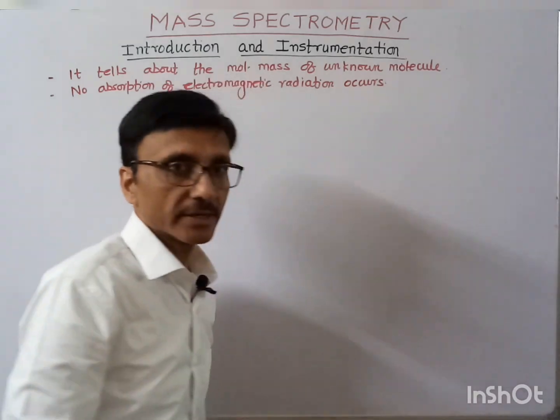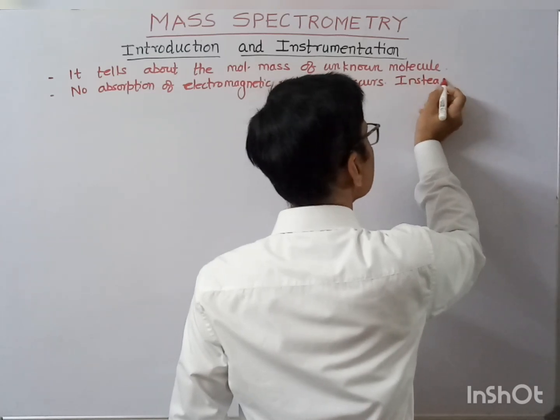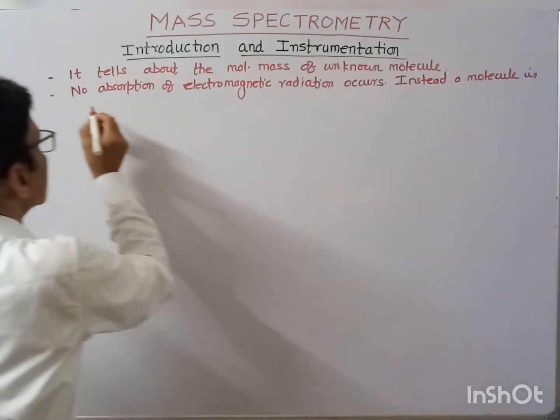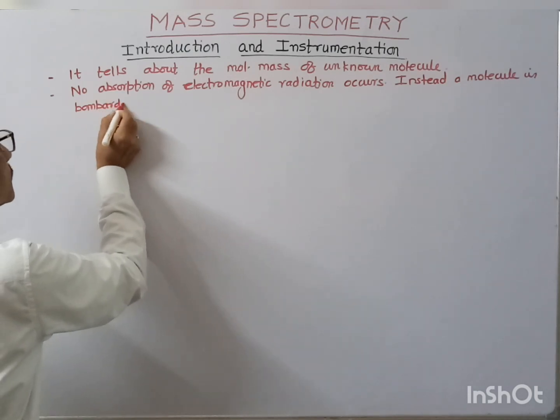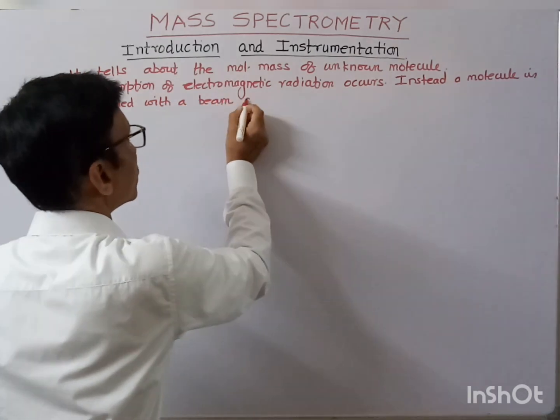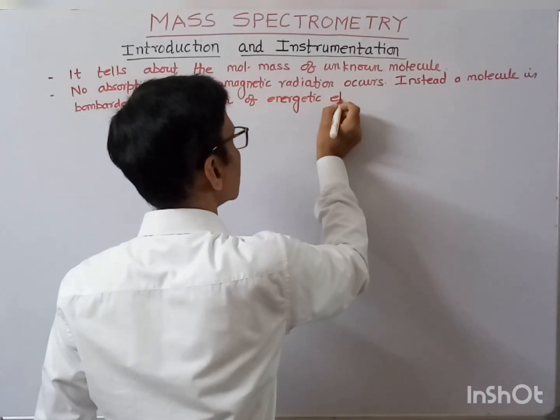Instead, a molecule is bombarded with a beam of energetic electrons.